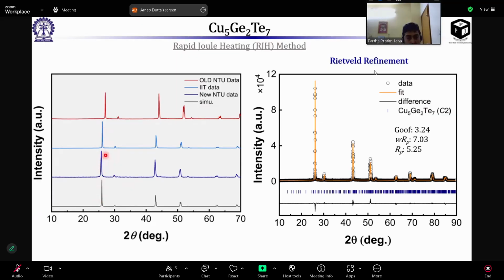With the same sample there is less shift. So the shifting is coming from the instrument, because he pressed the sample a lot when he was collecting the data in Bragg-Brentano geometry. Maybe that is why the instrumental error is coming, not from the sample. I mean, that's expected.